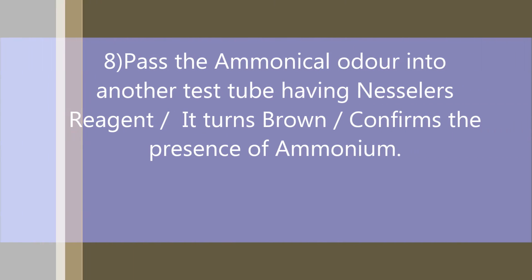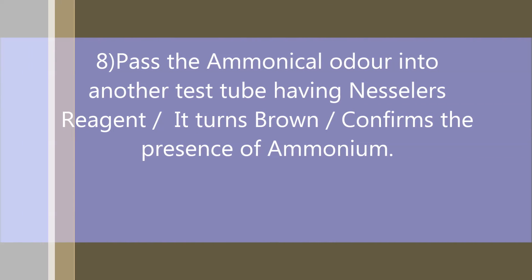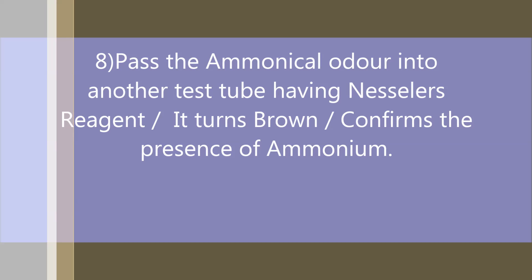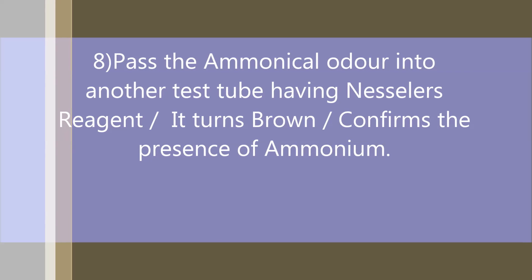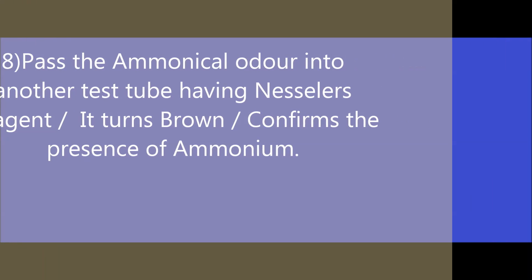Next, we pass the ammoniacal vapor into another test tube containing Nessler's reagent. We observe that it turns brown, and the inference is that it confirms the presence of ammonium.